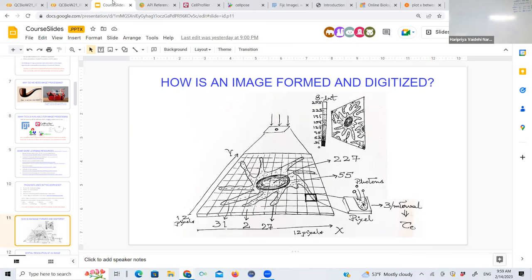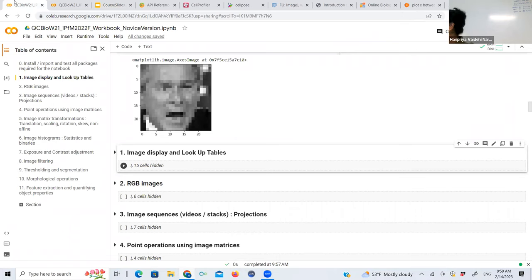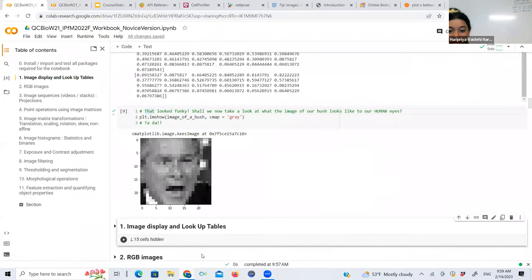Good question. We're going to go into that in the next section, actually. You can see these boxes, right? Each box is a pixel. And you can see the numbers, like over here, this number is 0.067, whatever. So if your pixels are really, really small, then you don't see the difference. Like in this photograph of Manuel, for example, the pixels are tiny. That's the resolution, exactly. If the pixels become big, that's when you stop being able to see the clear outline. And we're going to go into that in the next section.